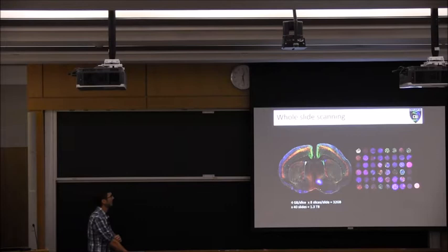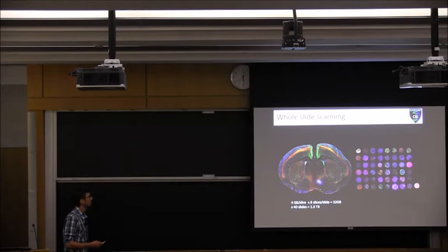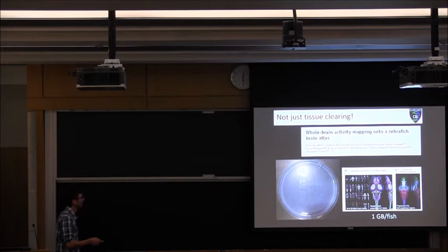A lot of you are doing a lot of imaging on the Axioscan. You can see this can spit out a lot of data really quick. If you're doing 4-color brain slices, you end up with about 4 gigs per slice. You put 8 slices on a slide, there's 32 gigs, do 40 slides, you're already over a terabyte of data. The Schier and Engert labs like to do these arrays of zebrafish at night. These end up being about 1 gigabyte per fish that they array out in these plates. You do 300 fish, there's 300 gigabytes.